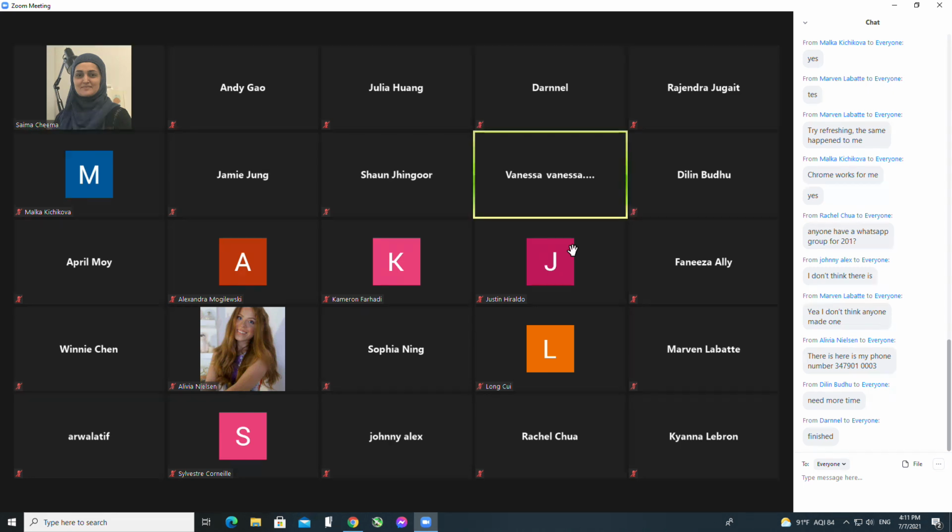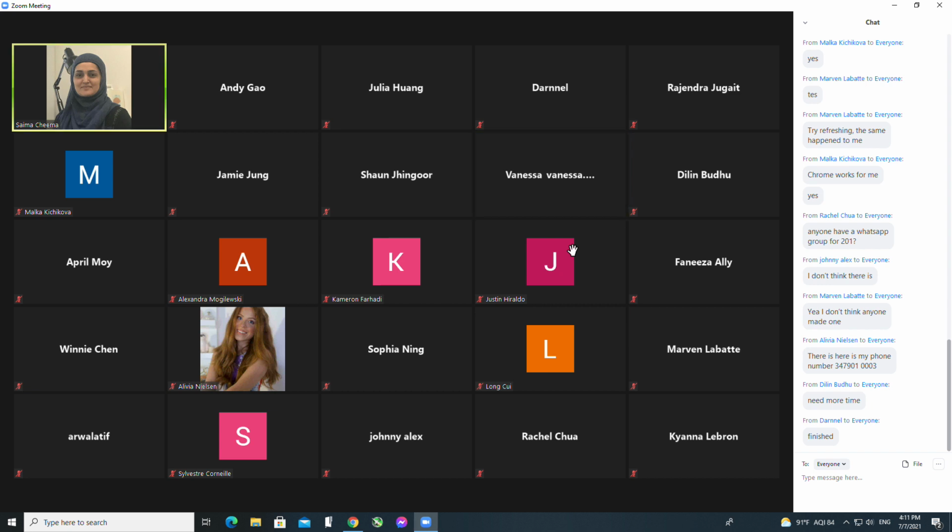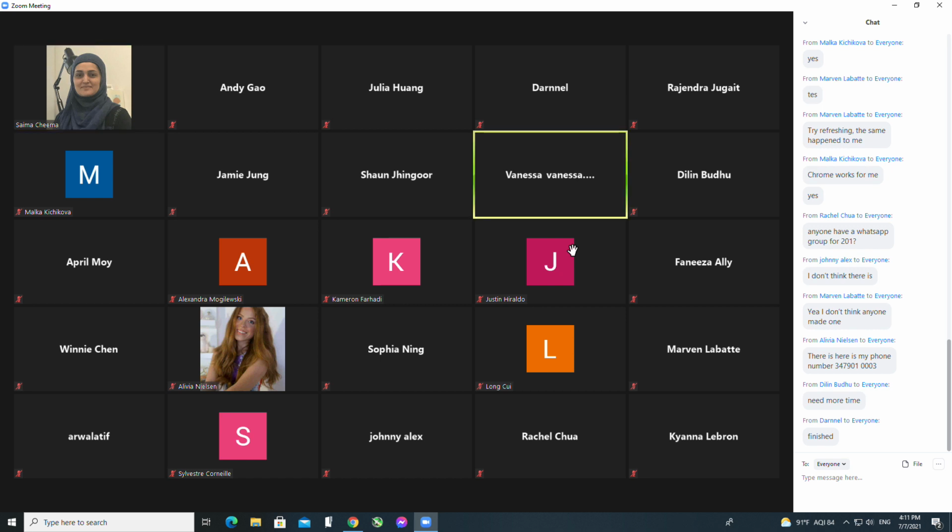I believe so. I put in the ocular ruler divisions and the stage micrometer divisions, and then I find the ratio to get each ocular division. Is that correct? Yeah, and then did you make the conversions in terms of micrometers yet? I did, but I'm not sure if it's correct. All right, let's do that.